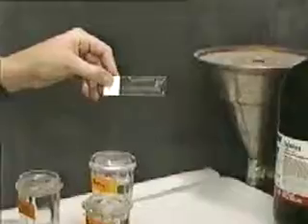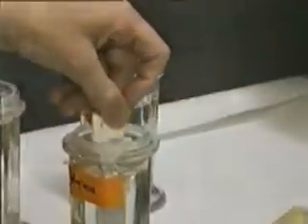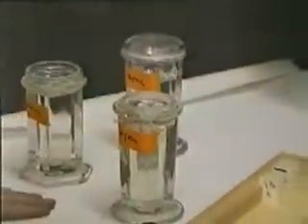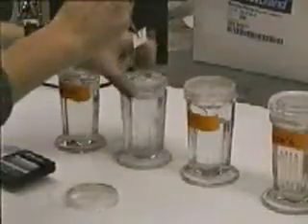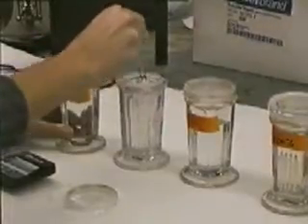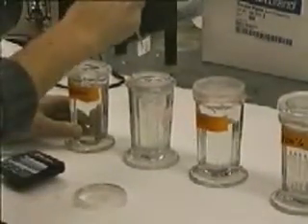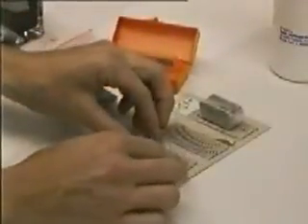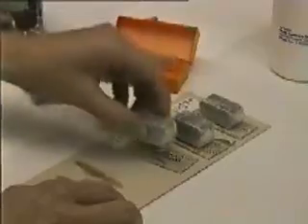After drying, the slides are deparaffinized by placing them into a Coplin jar of xylene for a set period of time. Subsequently, the slides can be run through graded changes of alcohol and into water for hydration and for staining. After staining, a permanent mounting medium can be applied to the sections, a cover slip added, and a small block weight added to flatten the layers during drying. After drying at room temperature or on a warming table, the slides are permanent and ready for observation with a light microscope.